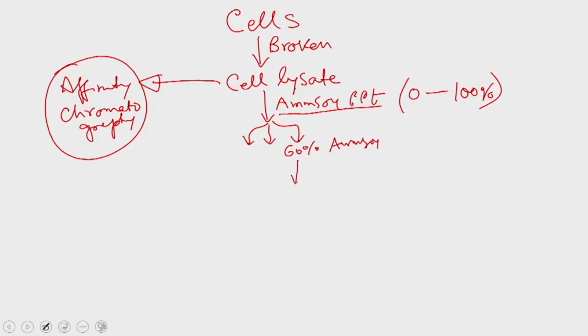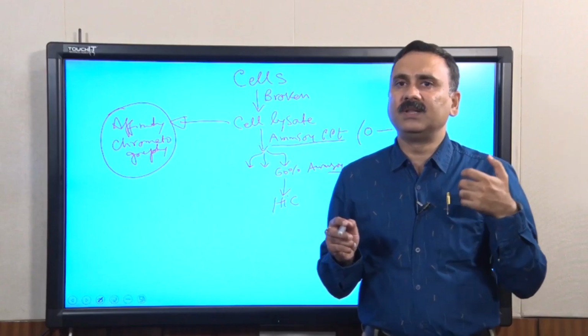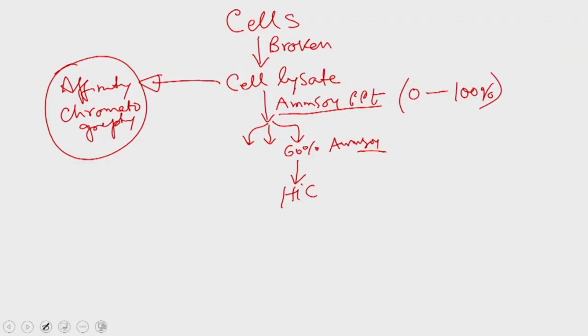What I will do is directly start running the HIC column. If you remember, we have discussed this in the past also, why HIC is a preferred column before the ion exchange chromatography: because you already have ammonium sulphate in this solution. You can directly add some more salt, which is required for the exposure of the hydrophobic patches present on these proteins, and then you can directly run the HIC. Once you are done with the HIC, you are going to get different fractions.